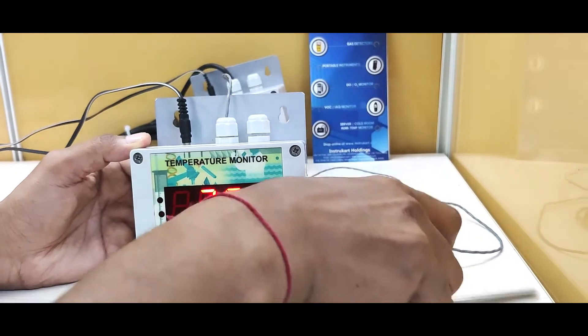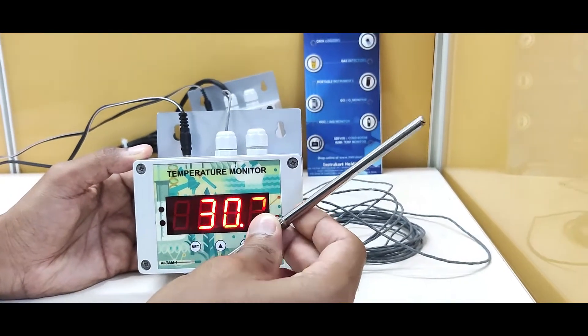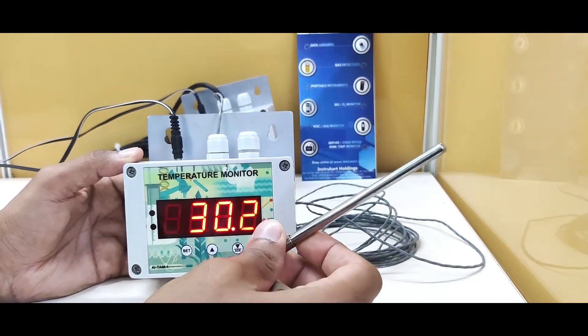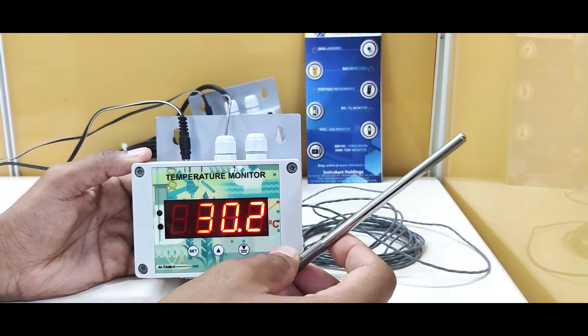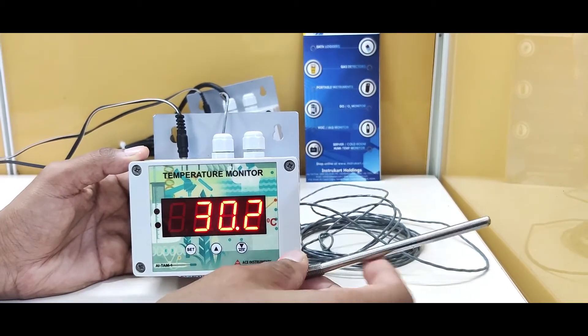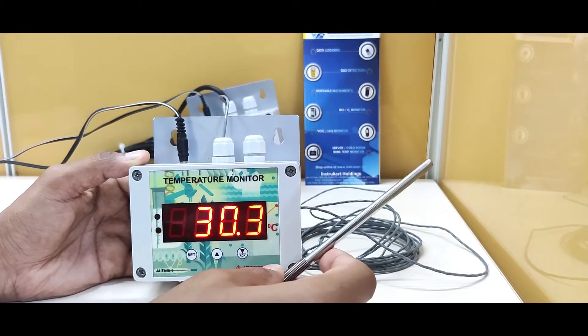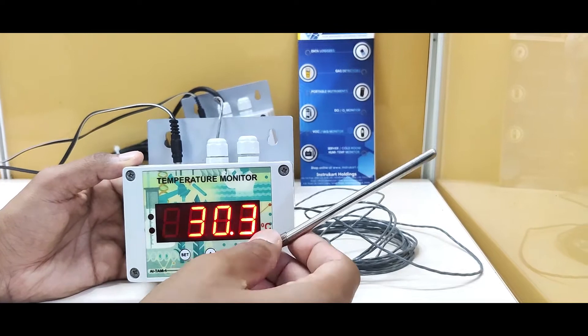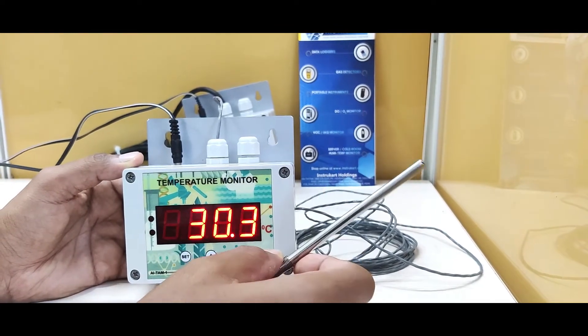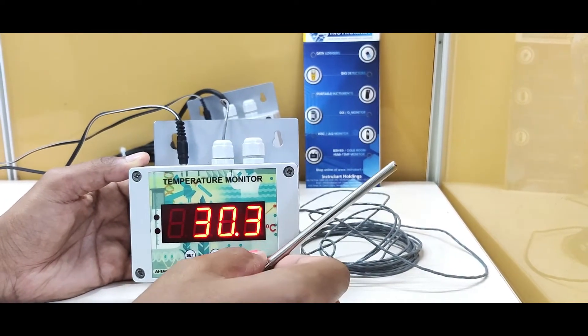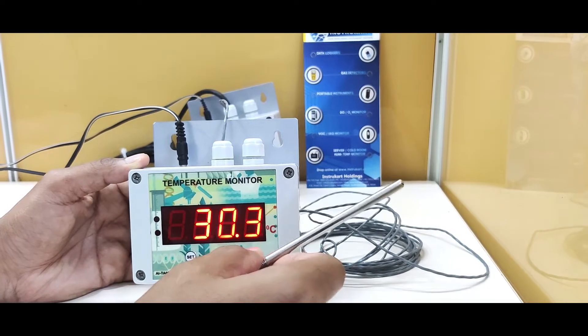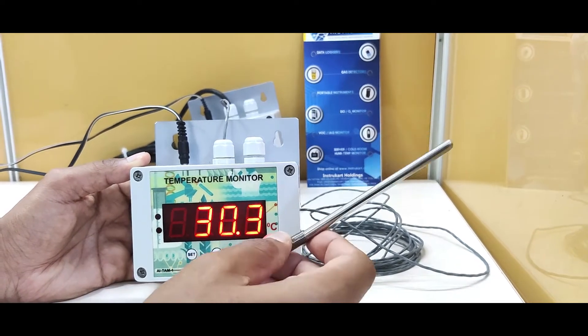This particular sensor, the RTD-PT100, has the capability of sensing from minus 50 to plus 150 degrees depending on the application. This includes cold chains, cryogenic labs, stockpiles, pharmaceuticals, IT rooms, and many similar applications.